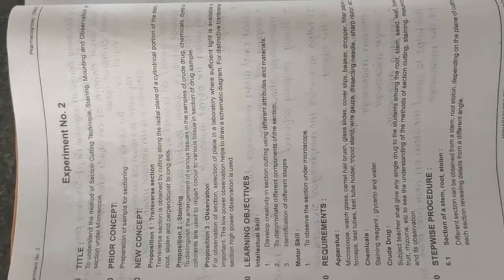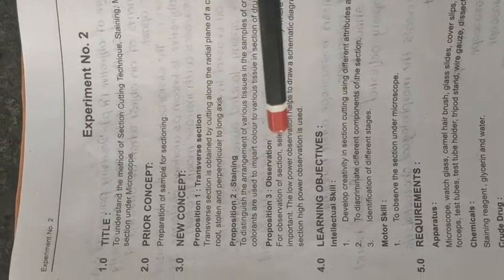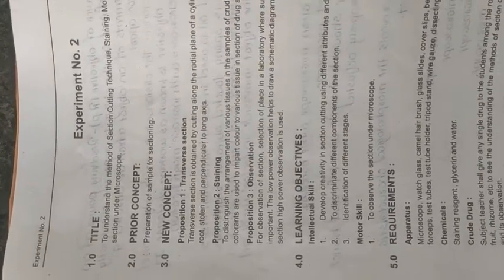In each experiment there is sample preparation, then transverse section, then staining and then observation under the microscope.